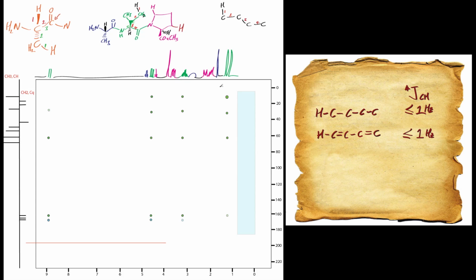But what you can see if you look around, and if we just get the HSQC up again so we can see the single bond correlations, you'll see the isopropyl signal and you'll see the alpha proton there. So let's just get rid of that a second. So this is the alpha proton that we're seeing. Now we know the alpha proton for valine actually comes here. So we're seeing the alpha proton carbon, and we're seeing the isopropyl carbon there, which we know comes here in the HSQC. So we're seeing all the carbon connectivity for that 1, 2 and 3 bond correlation. So we would be able to identify that carbonyl if the signal was strong enough. So we now move on to the other part of the structure where the signal will be a bit stronger.